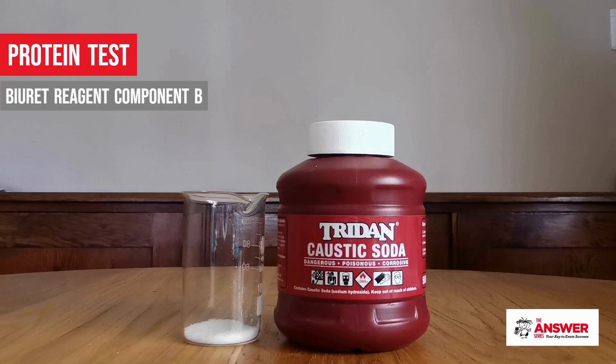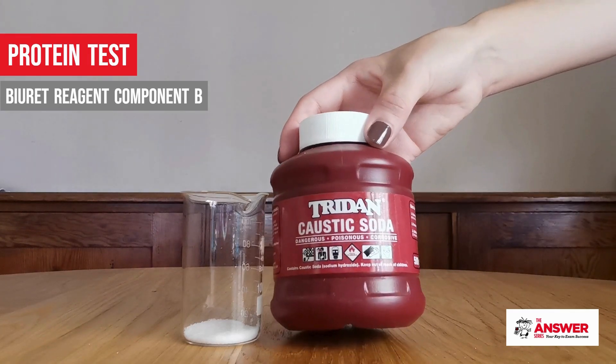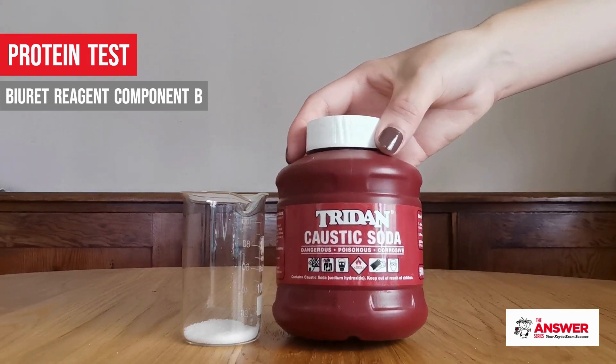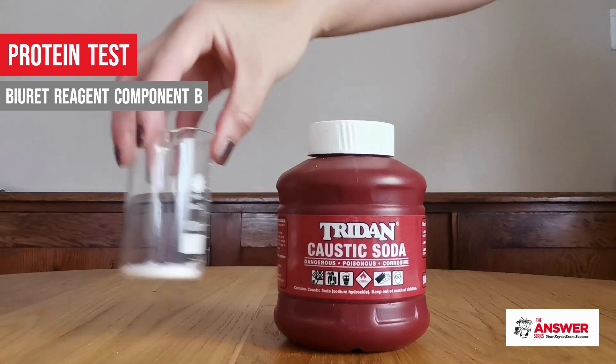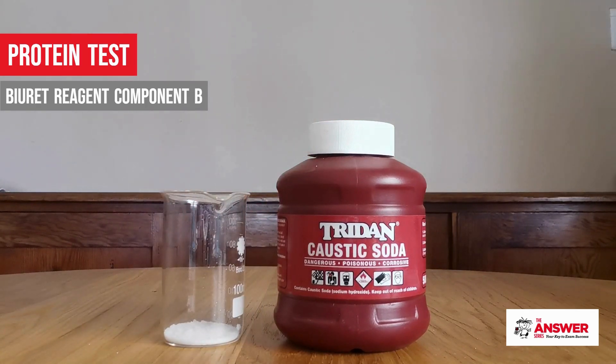Component B is a concentrated caustic soda solution. This is the one chemical that you must be very careful of preparing. Caustic soda is used in drain cleaner and can be bought at your local supermarket in the cleaning aisle. I like to buy one that uses granules because they're easier to work with.